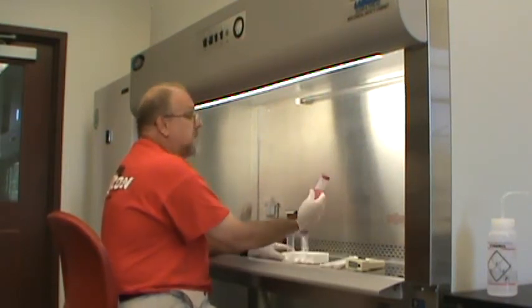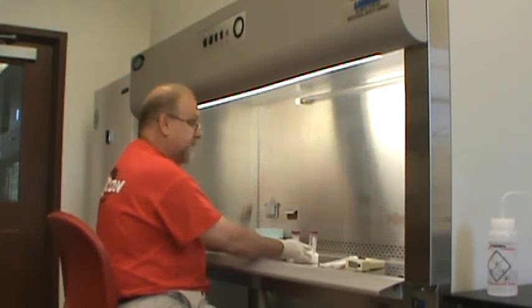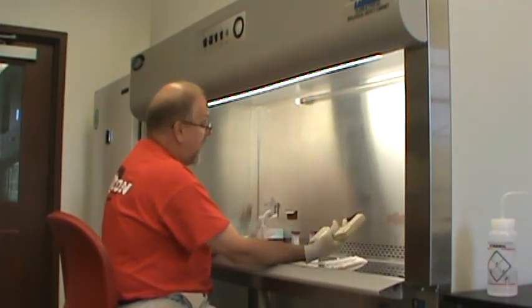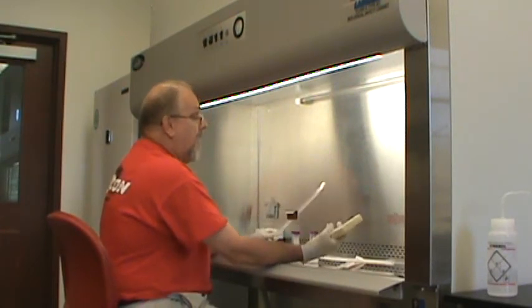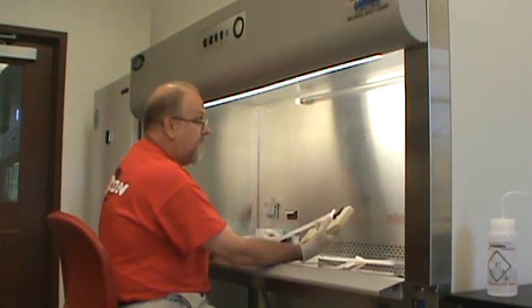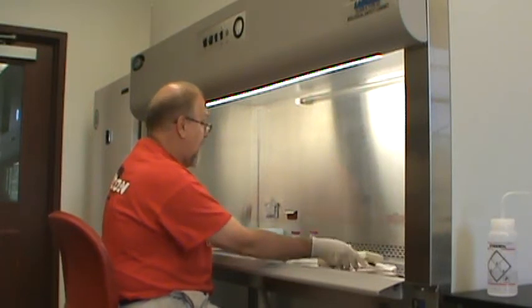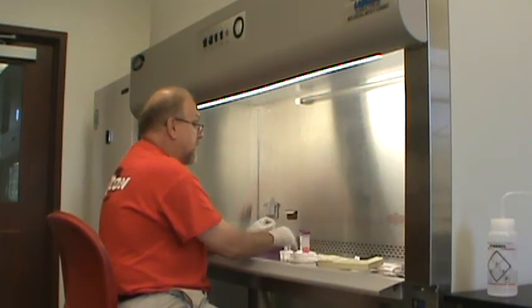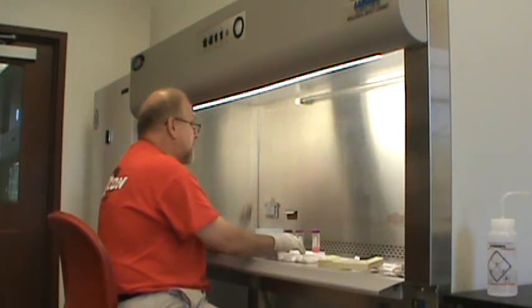If we want to transfer this sterile solution from this tube into these two tubes, we obviously need pipettes and a pipetter. The temptation is to immediately open these sterile pipettes and put your pipette in your pipetter, but then your hands are tied up holding onto a pipetter. What you need to do first is loosen the lids on all the vials — don't take the lids off, just get them so they are loose and still covered.